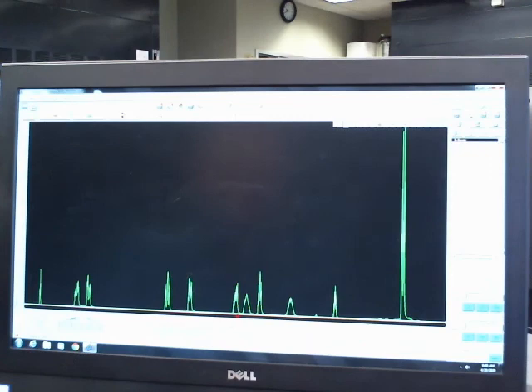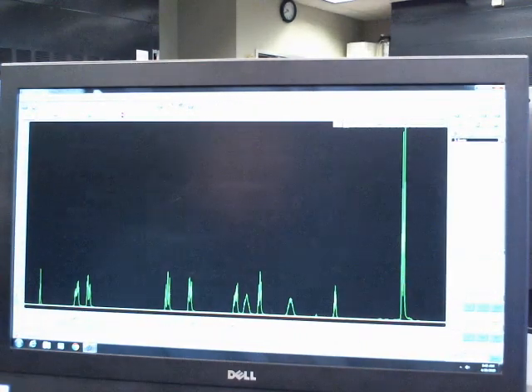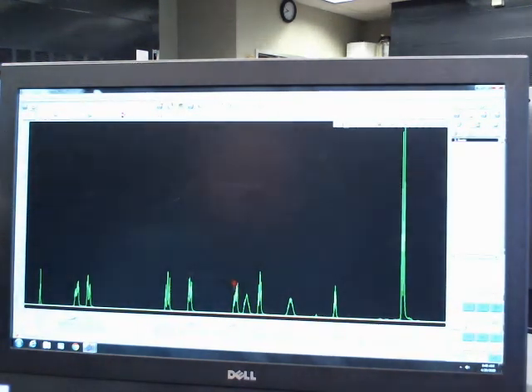This is A and this is B. We determined that because this was the methyl group. It was adjacent to this multiplet, which was C, and then we saw that C corresponded to this one, which was B, and that one correlated to this one, so we know this is A, B, C.